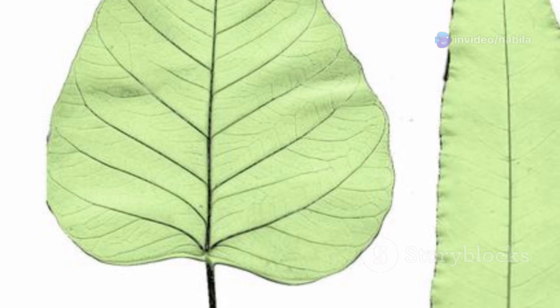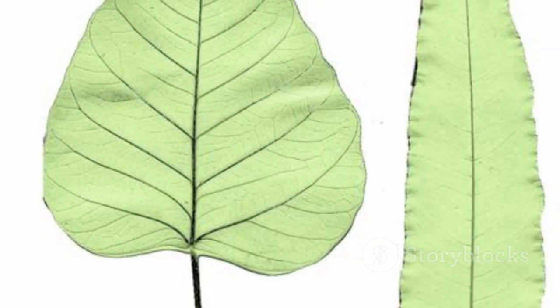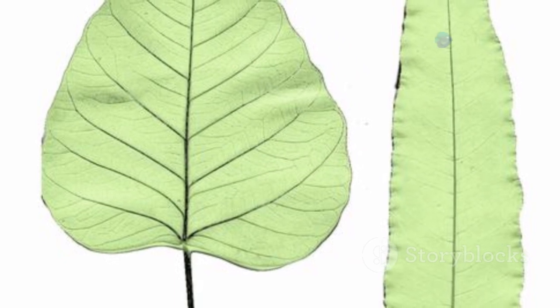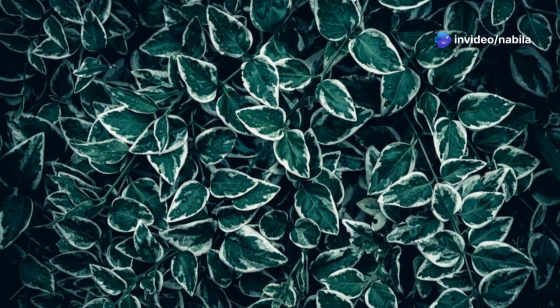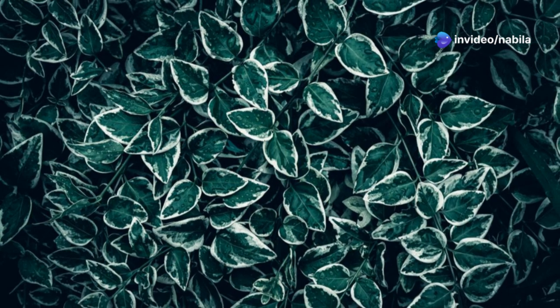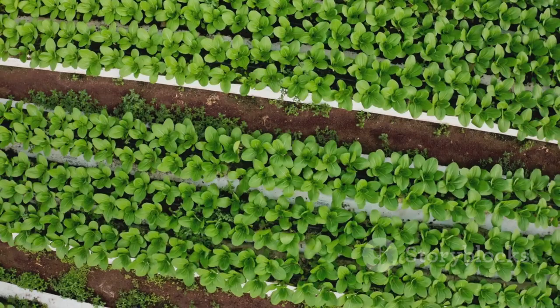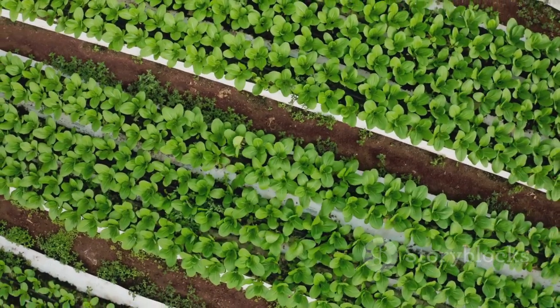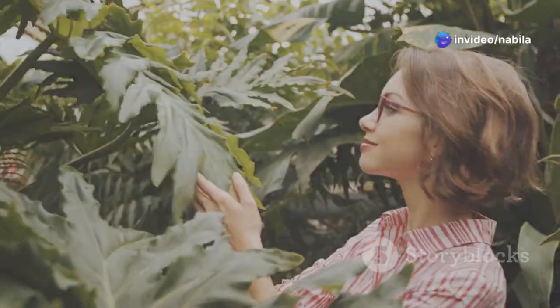The arrangement of stomata on the leaf surface also differs between dicots and monocots. This difference can affect the efficiency of gas exchange and water regulation. Dicot stomata are scattered randomly, which allows for a more even distribution of gas exchange across the leaf surface, while monocot stomata are often arranged in parallel rows. This arrangement can be more efficient for certain types of gas exchange and water regulation.